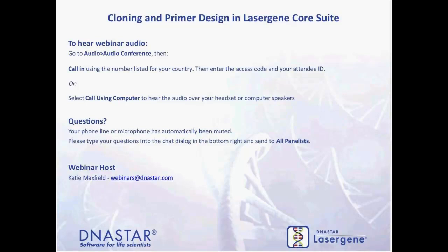And Brian is going to be doing the majority of the webinar today in a live demonstration of the Lasergene software. And to start, he'll give you a brief overview of cloning and primer design in Lasergene Core Suite.